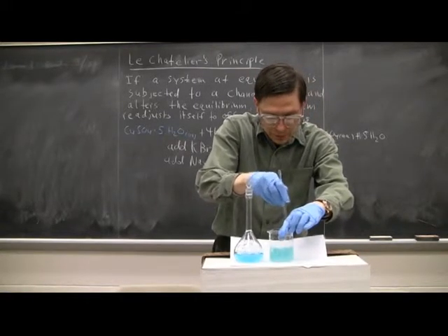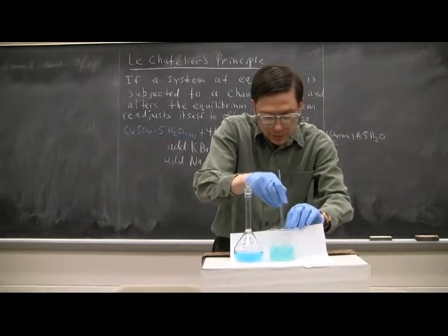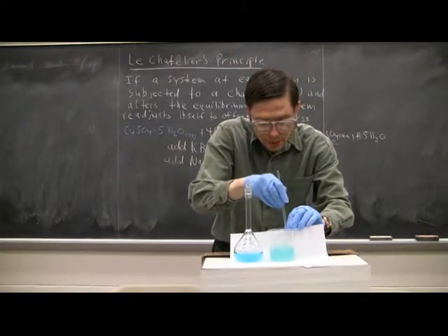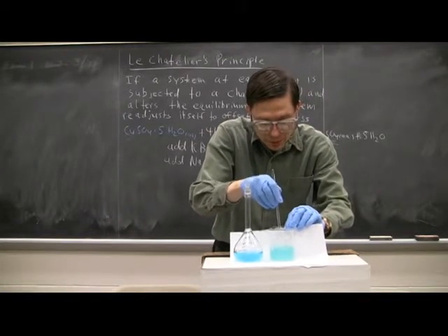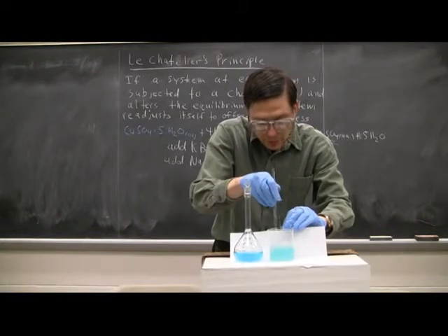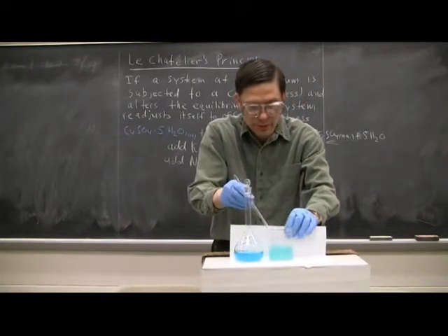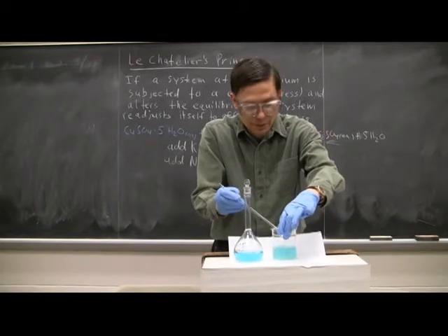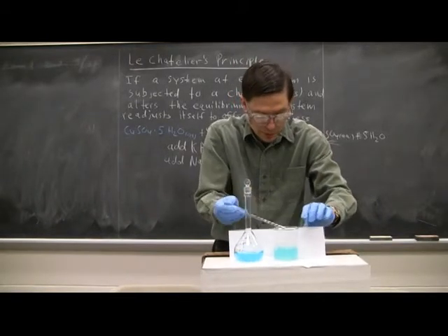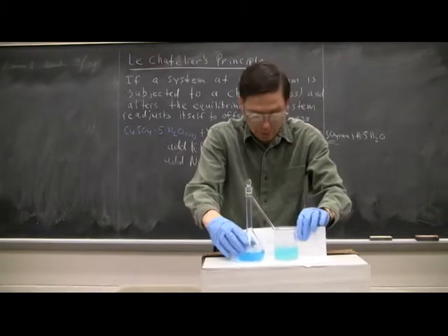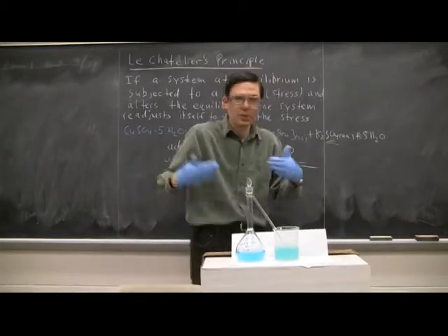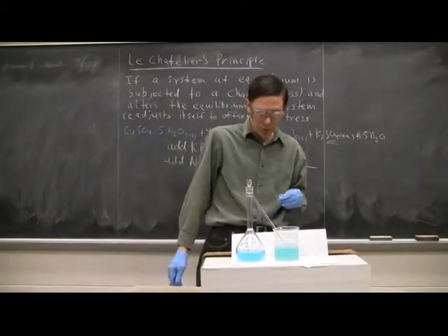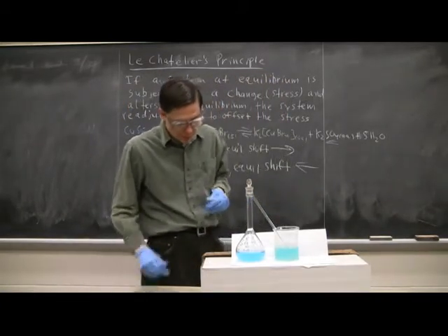I think that's about as far as we're going to get it to go. But again, it's not as green. It's not going to be the original blue color. And I probably, if I really kept stirring away here and dissolved everything, it eventually would go back a little further. So again, this is the color we're getting here. It did switch back, not necessarily completely back to blue, but that's okay. It's not as green as it was before.